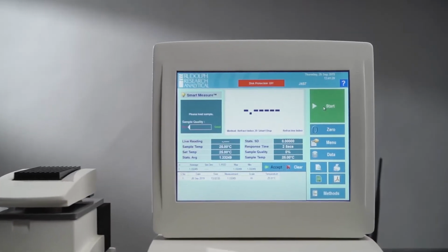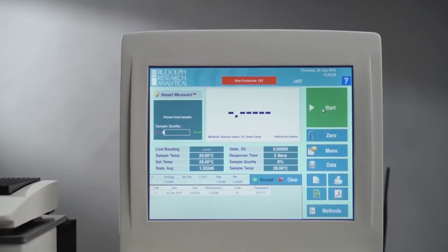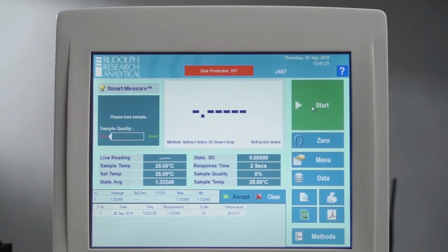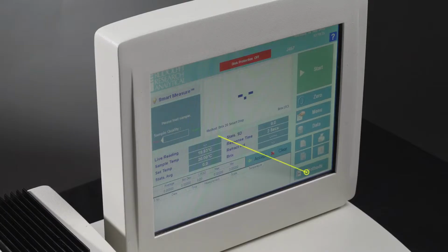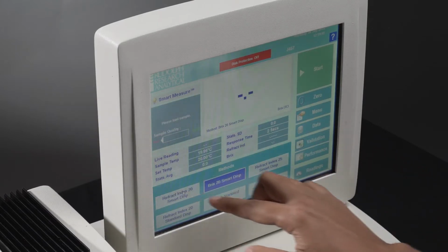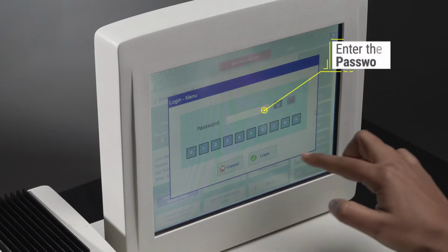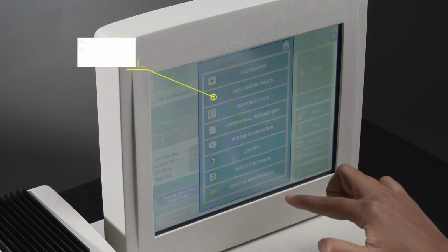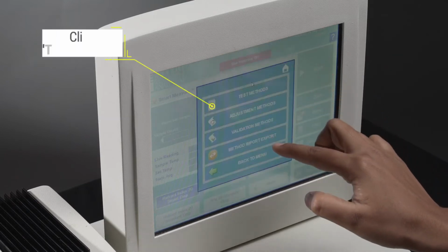Once the connection is completed, open the instrument software application and set up the method for transferring the data for testing. In this application, since we need to just test the data capture, we will change the method setup to just single reading.